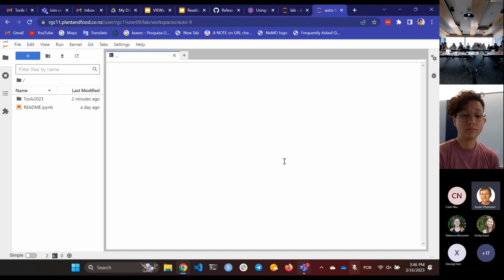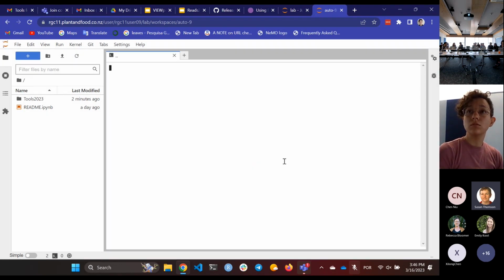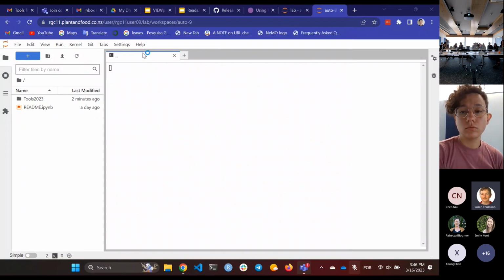I want to go to the document. Okay, so links to the chat routines. Should it be my computer? You can run on the computer. It'd be easier to not go through, can you do it in terminal? Can you SSH to their terminal? Maybe.